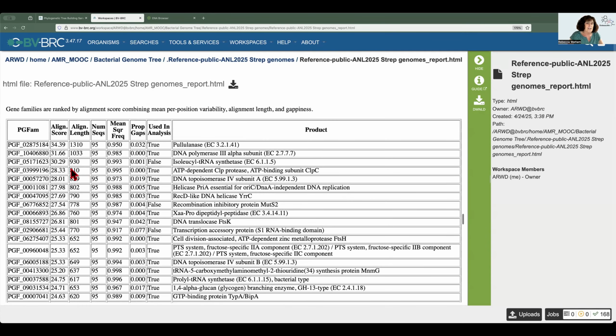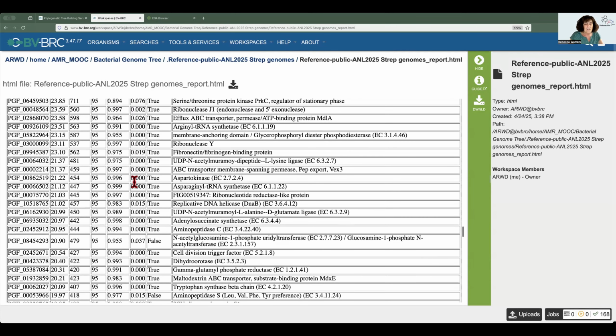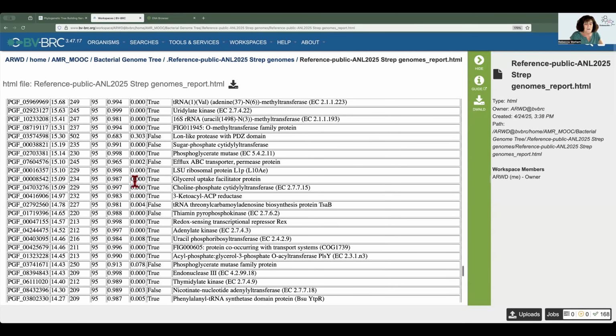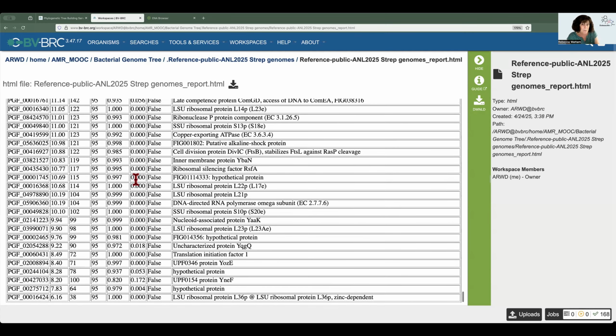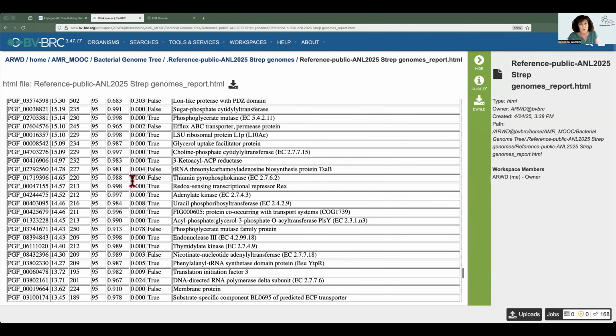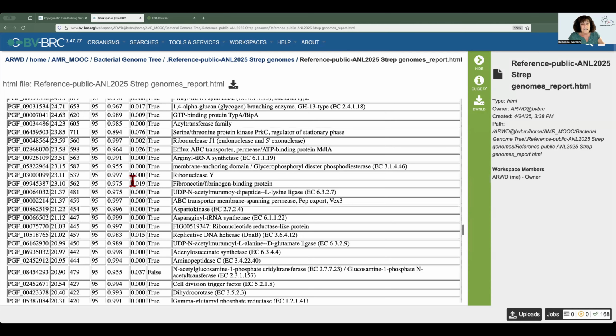And if you look at the top, it tells the alignment length. So it gives you the information on those. And if we scroll down, that should be it for the report. So for this particular video, I just want to really concentrate on this report. There are a lot of files there if you want to look at it.